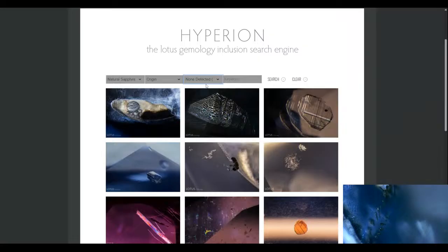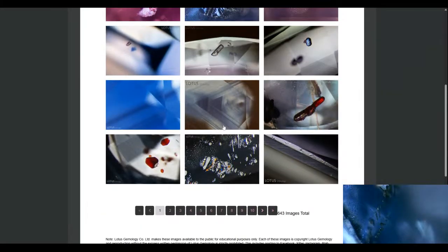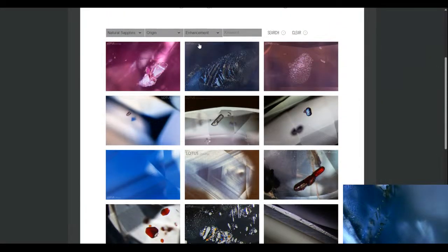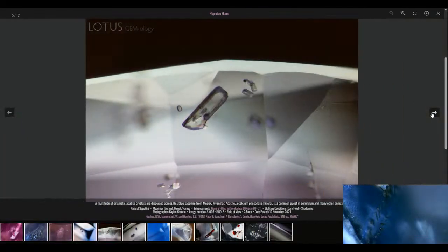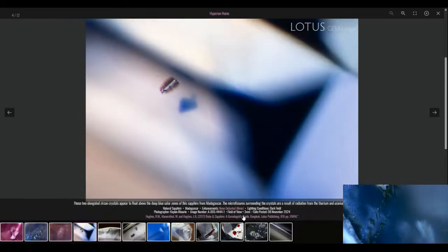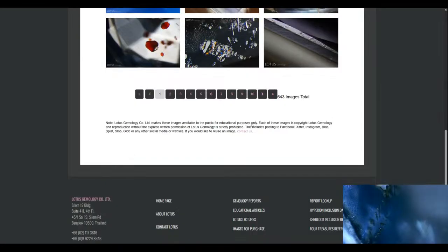Let's take a look at some fissure filling enhancement. Let's see. The library is also not perfectly structured, but yeah, you will find yourself through it. There's a fingerprint. You can see these a lot in many gemstones, actually. That was a diffused one? No, it was an unheated one. I'll show you some treatments.